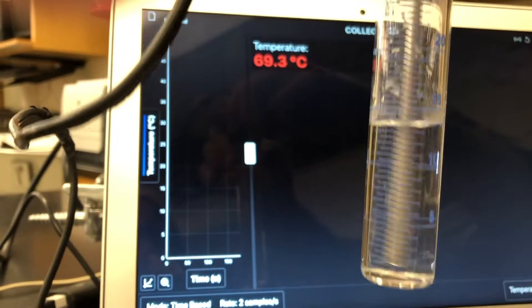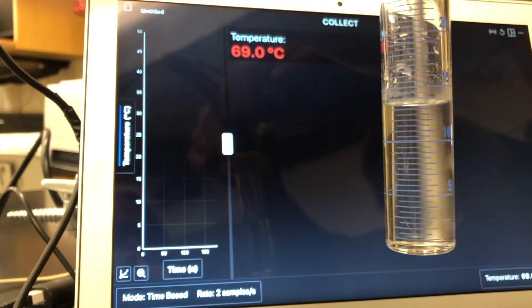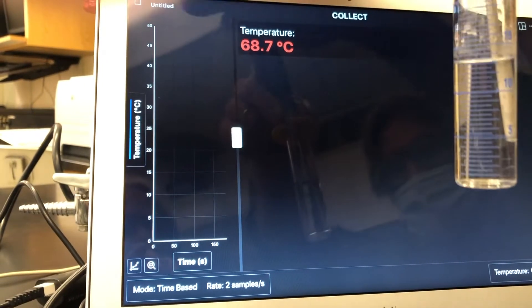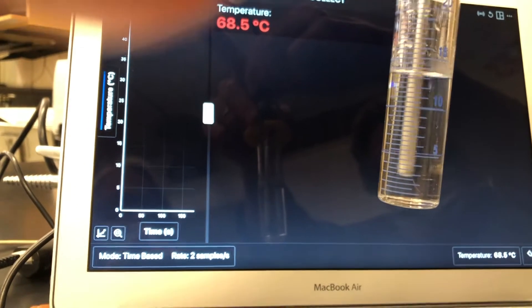Then we're going to slowly let it cool while stirring and wait for crystal formation to start. You have to be a little — maybe a lot — patient. It takes a while. We want the moment at which crystals just barely start to form.